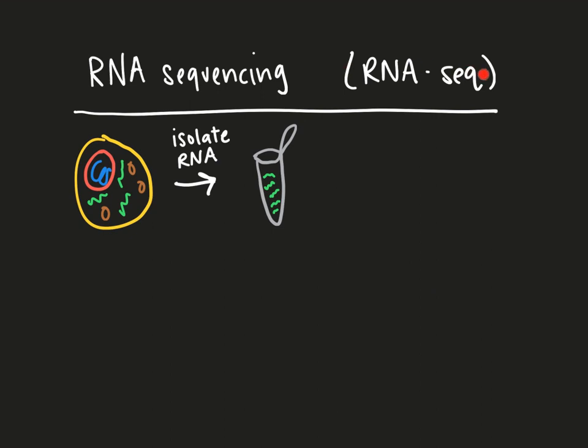Or from now on, I'll just say RNA-seq. The first step is to start with either a population of cells, that is maybe an entire tissue worth of cells, or today we're getting to where we can isolate RNA from even a single cell to do an analysis. So whatever you're starting with, a population of cells or a single cell, you will have everything that's in that cell, right? You'll have DNA and cell membrane and proteins and RNA. And by some mechanism, you want to isolate RNA so that at the end of that, you have a tube that just contains your RNA.